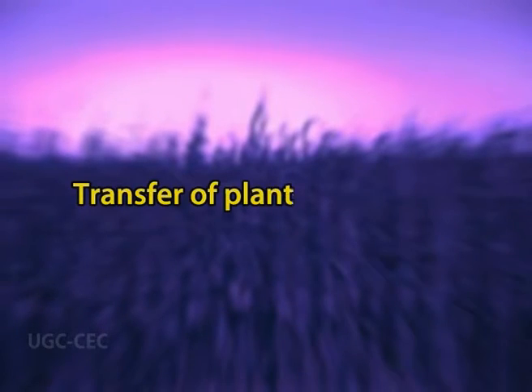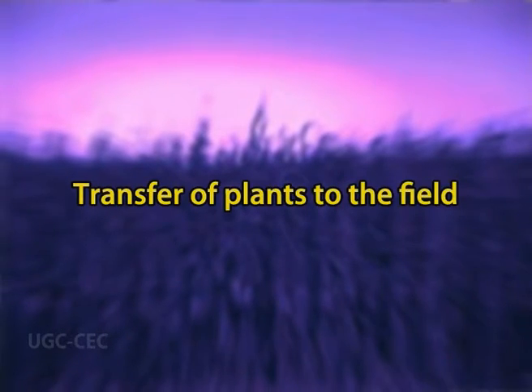Plants are irrigated regularly with dilute nutrient solution or simple water. It's also very important to maintain high humidity conditions initially. Gradually, the plants develop cuticle and their stomata also start functioning. The final step in plant tissue culture technique is transfer of plants to the field.